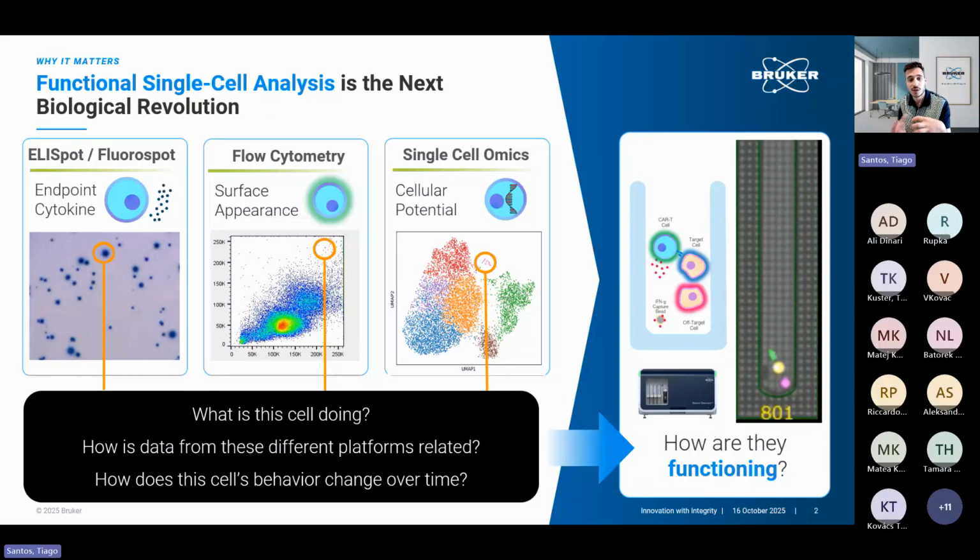We analyzed the fluorescence of caspase-3, an apoptosis indicator that allows us to really track exactly when that specific CAR T cell did contact with the cancer cell and when it was able to kill it.